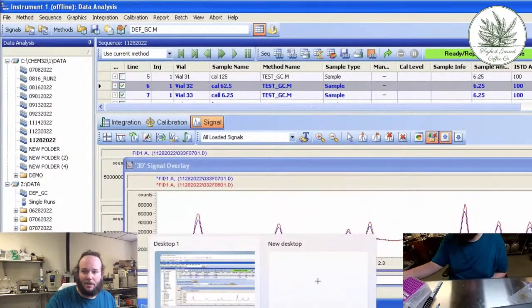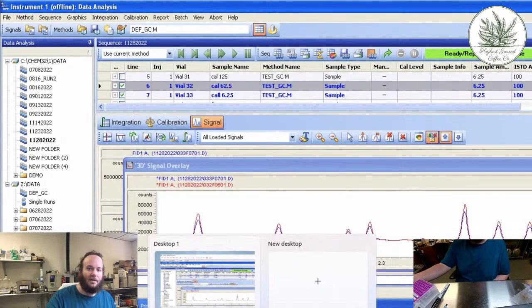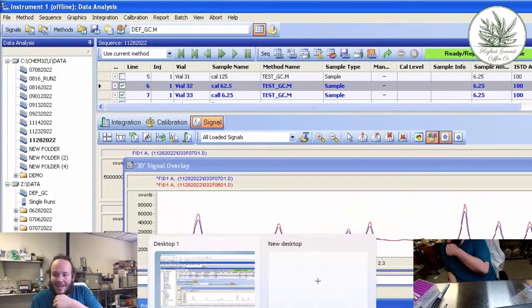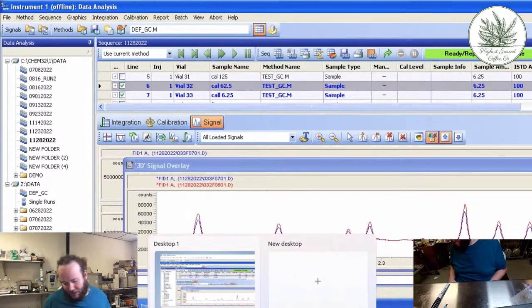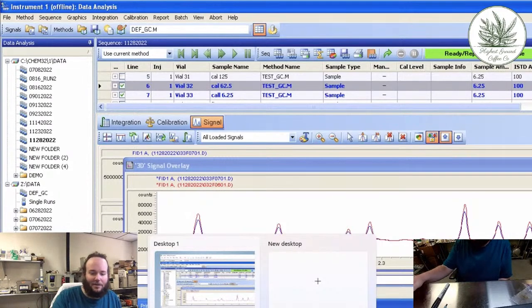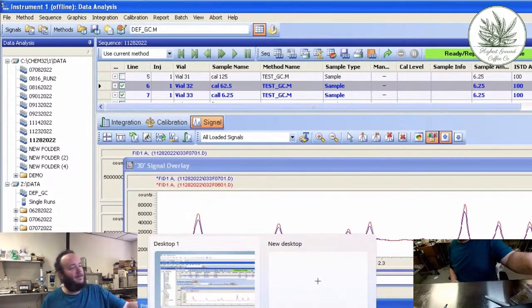Be a little smaller and less prominent. Windows XP for real, yeah. Yeah, it's funny because this is the newest software I could get to run that runs the version of ChemStation that works on the gas chromatograph. Hey, Crystal. Welcome. Thanks for joining.